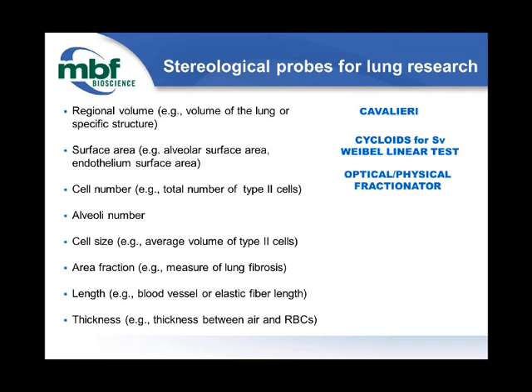If you're looking for how many cells are there, here's two different probes you can use for thin or thick sections, the optical fractionator or the physical fractionator. My colleague Masha is going to show a demonstration of the physical fractionator, not to estimate the number of solid particles, but if you're looking for the number of air sacs or alveoli, there's some special things you need to do in order to identify the alveoli, and Masha is going to give an example of how the Stereo Investigator software can be used to estimate the number of alveoli, and that'll be after I'm done with this broad outlook.